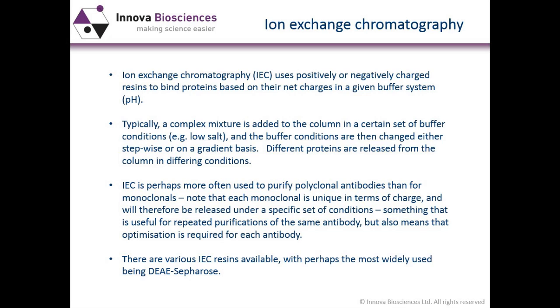There are all sorts of ion exchange resins available, but probably the most widely used is something called DEAE Sepharose, which many of you may be familiar with.